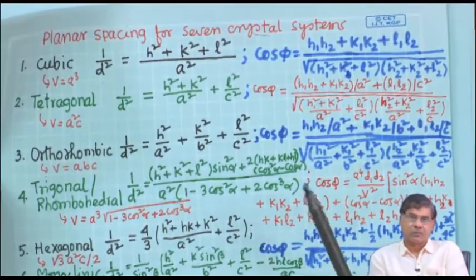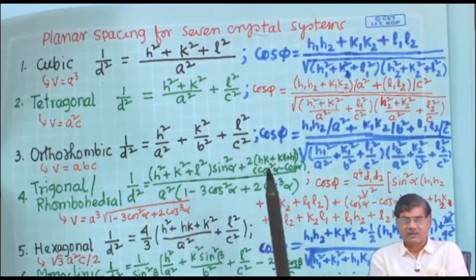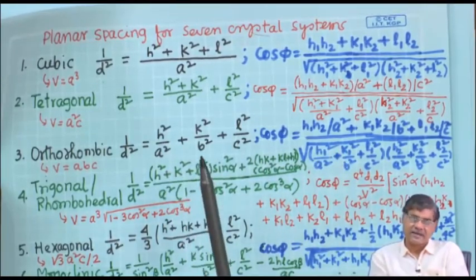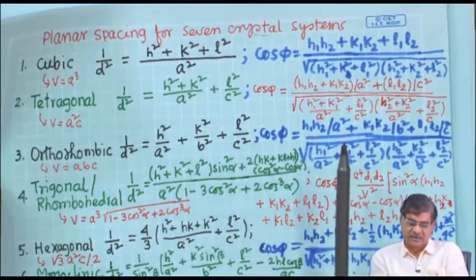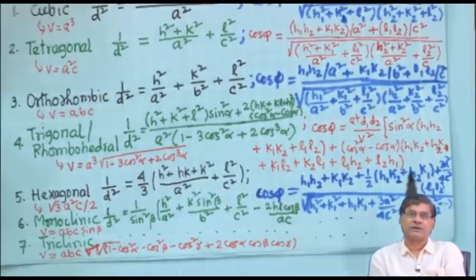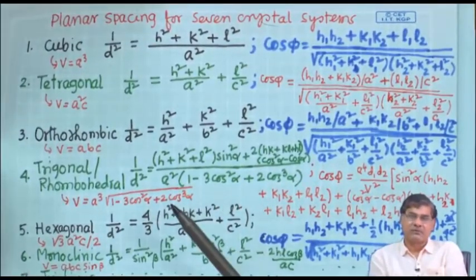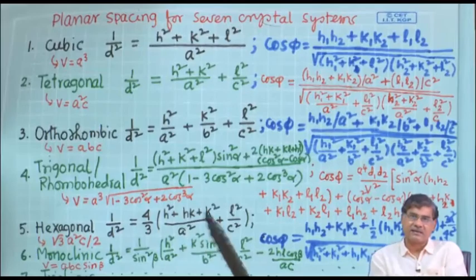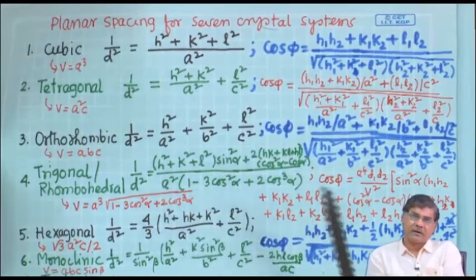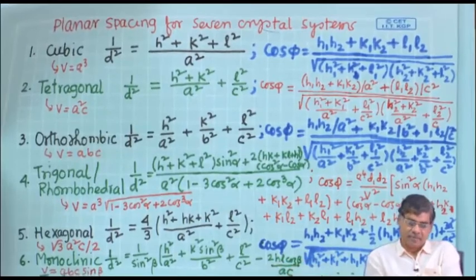Okay. So from one peak, from one relation, you cannot find out this value. So you need more relations, so you need to analyze more peaks. So from this relation, whatever I showed you here, and the procedure I told you on how to index the Bragg peaks, using this knowledge one can determine the structure of the crystal.